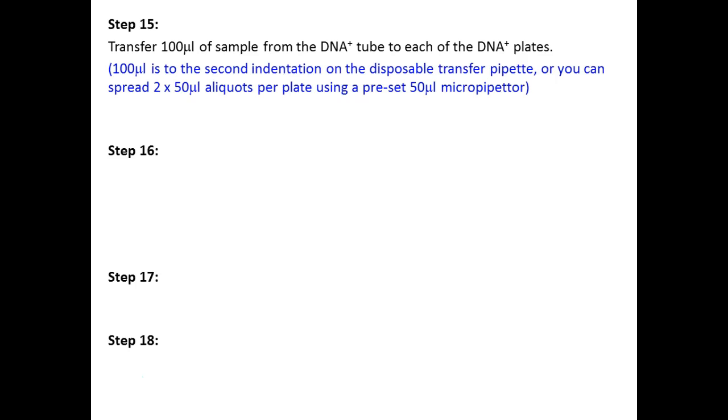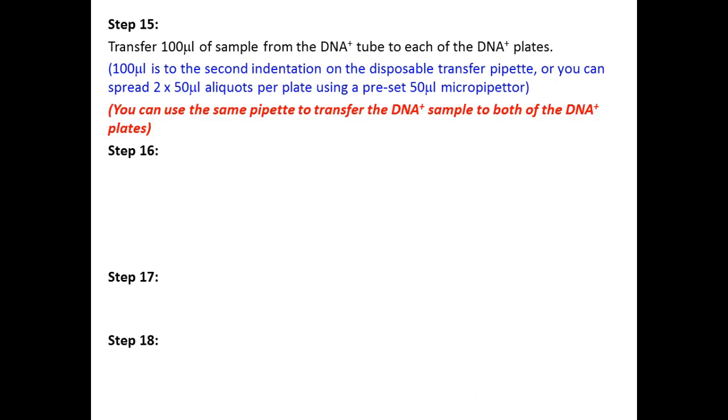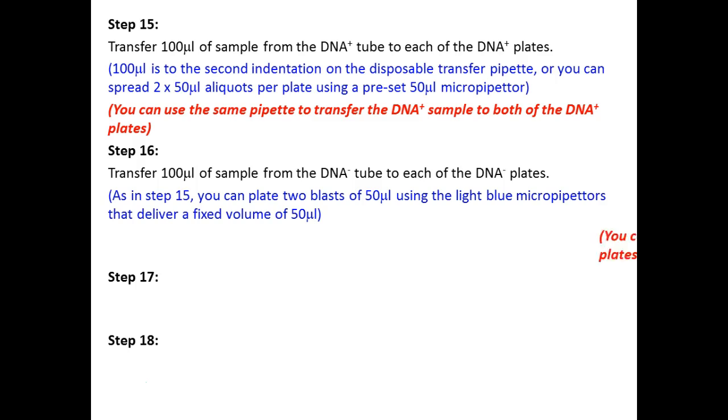For both your DNA plus plates, you can take from the same tube, you can use the same tip, right? But then when you're doing your minus plates, you've got to change tips, right? Because we don't want to cross-contaminate. And so you're going to do your plus, then your minus.